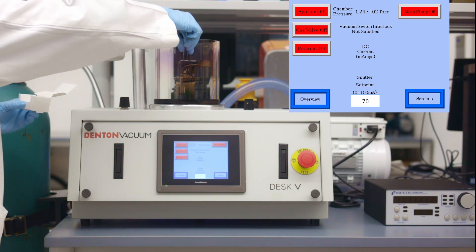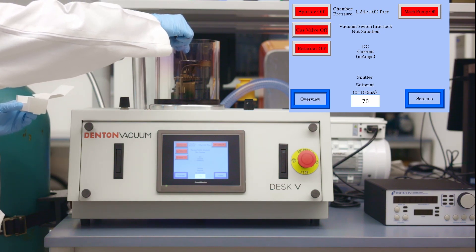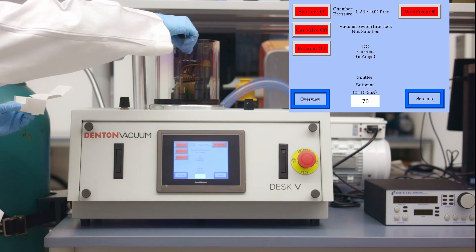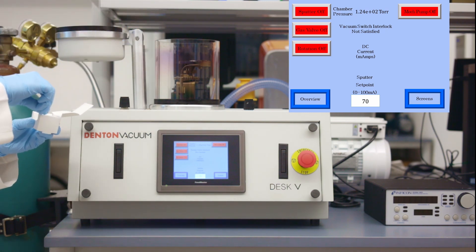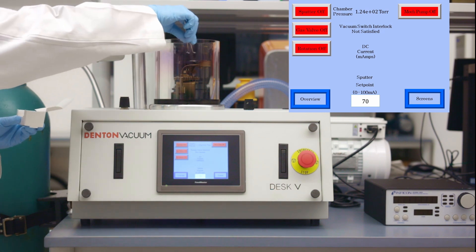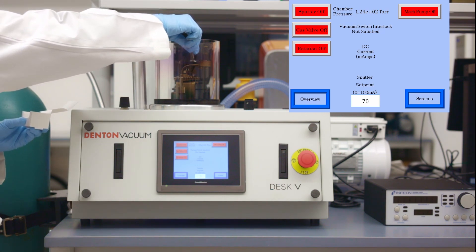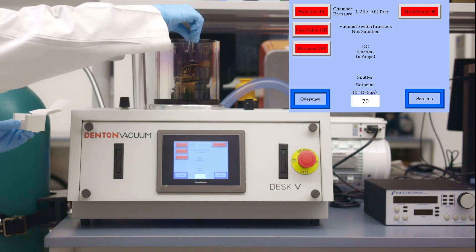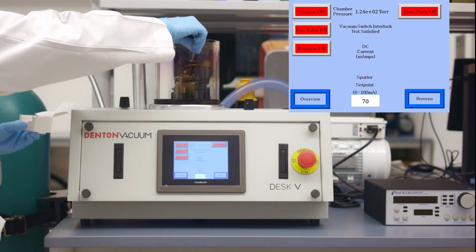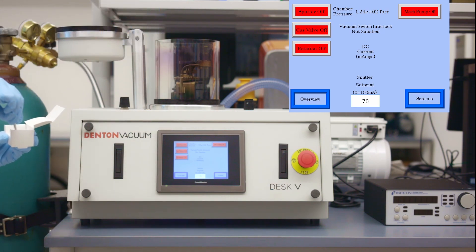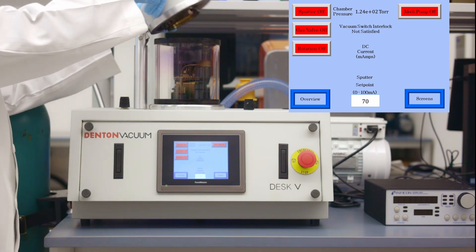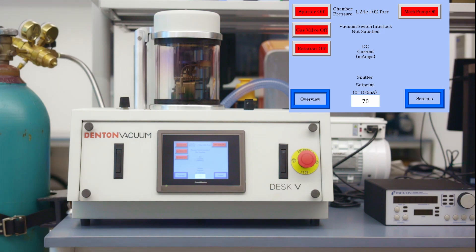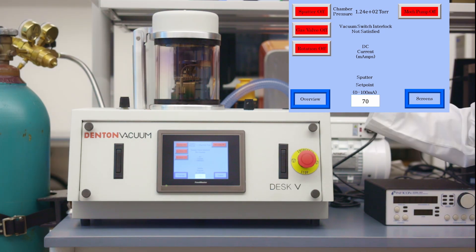Carefully remove the samples and store them in the box. Replace the lid on the glass jar and turn off the sputter coater by toggling the power switch on the back of the sputter coater.